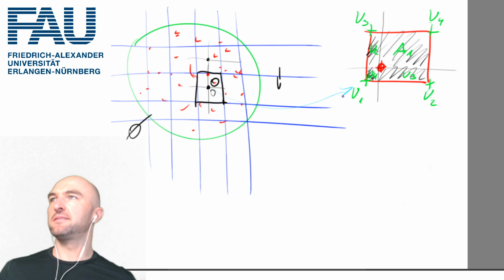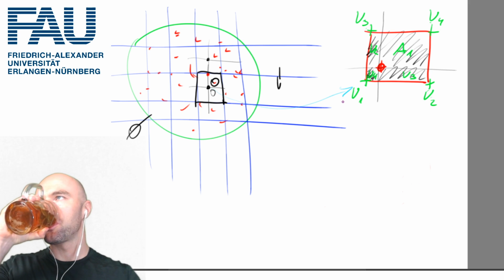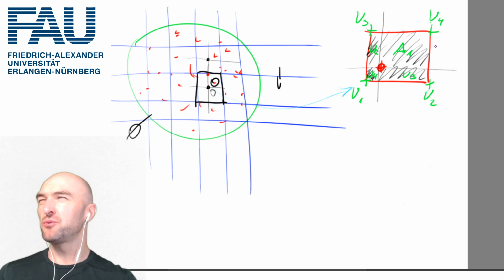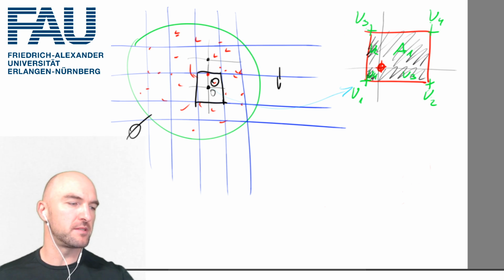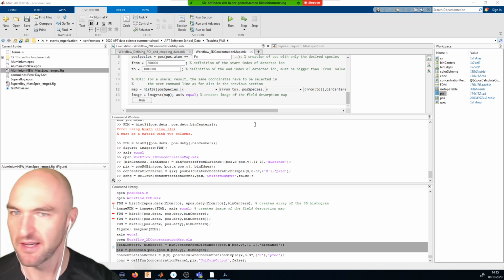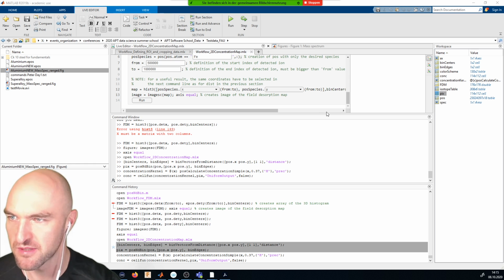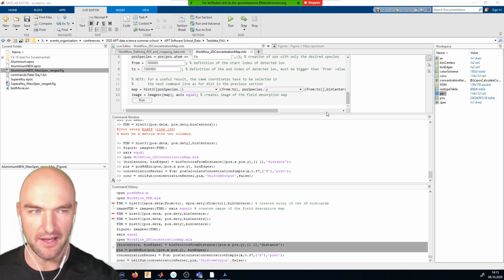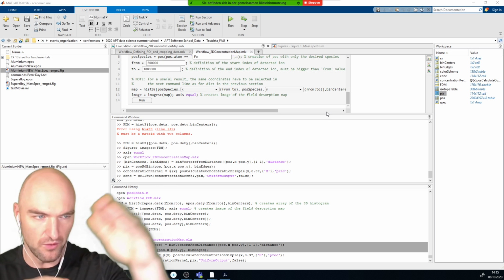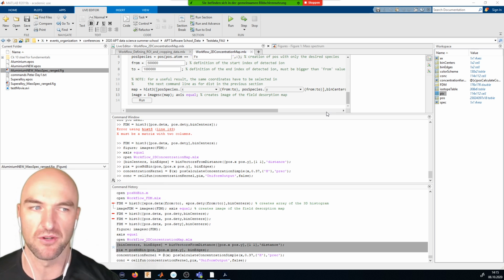So yes, this can be implemented, and this probably should be implemented. So we'll note it down, Andy, and I'm not quite sure if it's going to make it into version 1.0, but it certainly can make it into one of the higher versions. And then you can just create a mass spectrum with quarter atoms or fractional atoms or whatever, and then work based off of that.